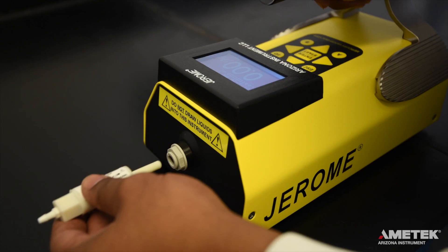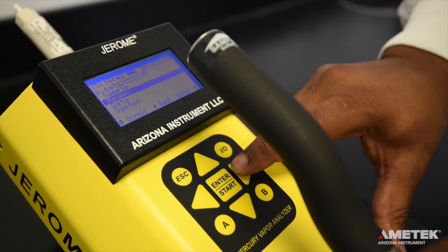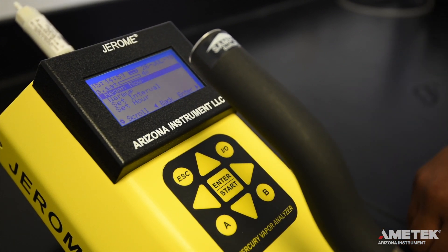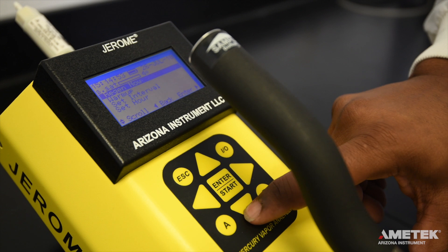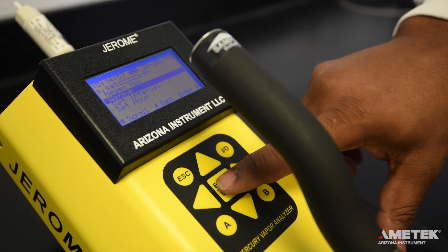Now that you have successfully performed a sensor regeneration and the Clean Air System Check, it is time to take a sample. Please note that for EPA cleanup levels less than three micrograms per meter cubed, it is necessary to run a warm-up routine with the Zero Air Filter before sampling. To do so, install the Zero Air Filter and select Warm Up from the Regen menu. This will initiate a five-minute warm-up. For levels three micrograms per meter cubed and above, the warm-up is not necessary.